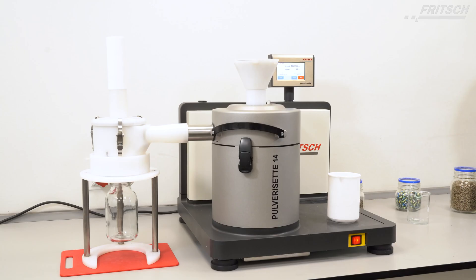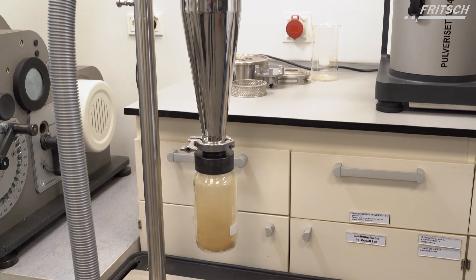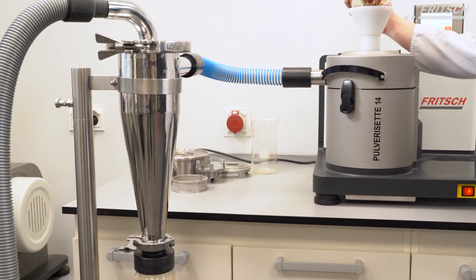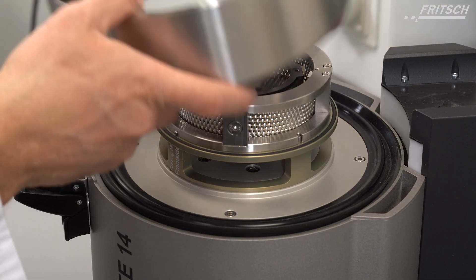The airflow of the motor can be further enhanced by the option to connect an exhaust system, and the cooling effect of the sample may be additionally increased by using a Fritsch Cyclone separator. With their powerful airflow, the Fritsch Cyclone separators ensure simple feeding and faster throughput, and enable the use of finer sieve rings to achieve a higher final fineness.